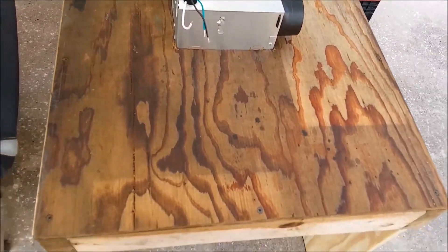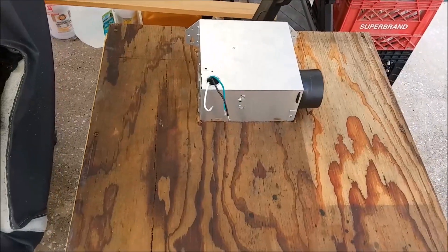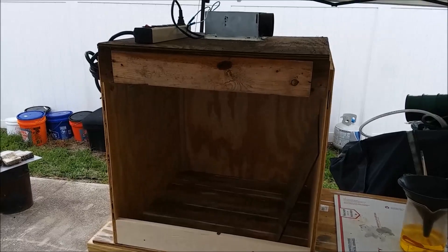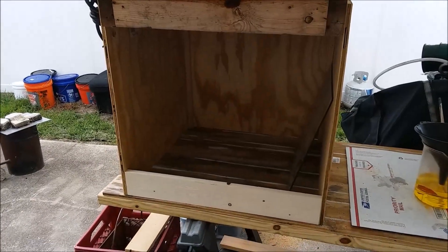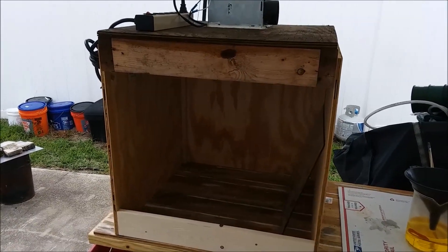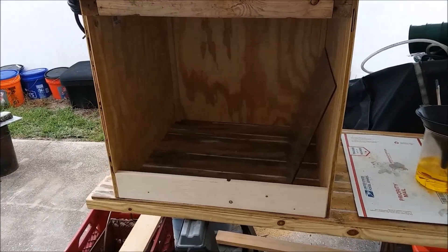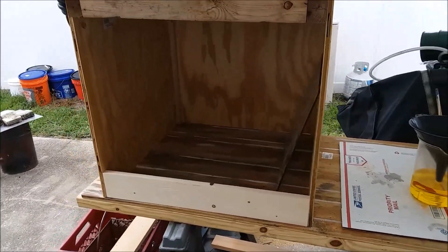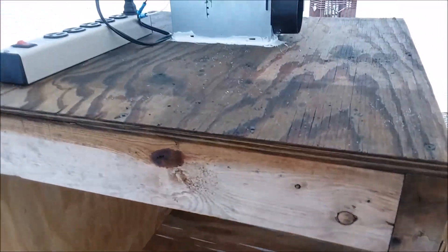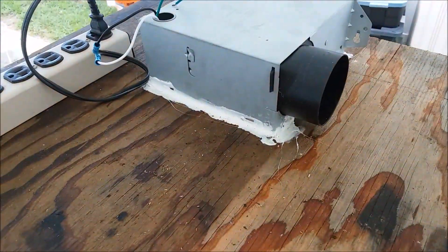I actually got to do a little work on my fume hood today. I think I have breathed enough sulfur or nitrogen dioxide gas to last a lifetime, so I need to get this working. It's just a wooden box — basically a three-sided wooden box, four-sided counting the top — and I've got a bathroom vent fan mounted up there.